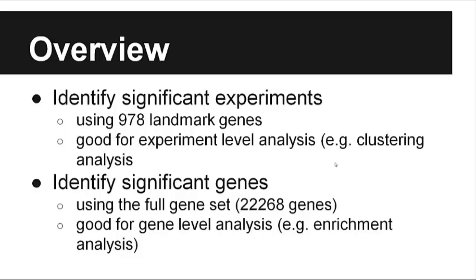So the result from the first part is good for experimental level analysis, where you do not want to involve any genes, such as clustering analysis. The second part is good for gene level analysis. For example, if you want to do enrichment analysis.